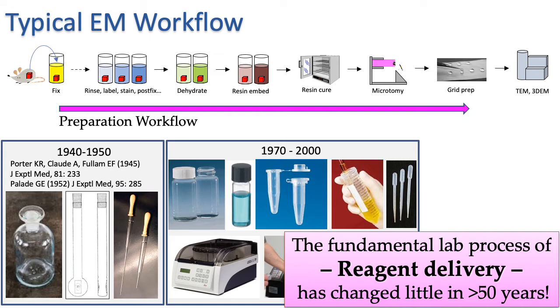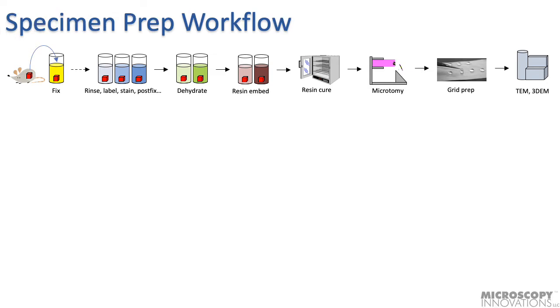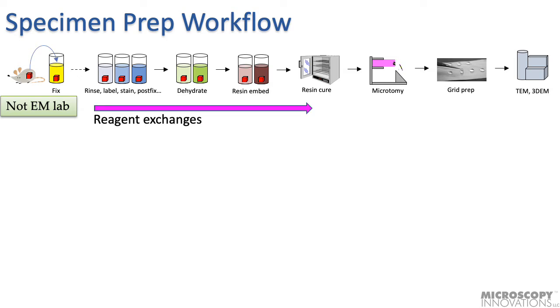Let's take a deeper look into the workflow for different specimen prep applications. The beginning of the chemical prep workflow is the initial aldehyde fixation, which is often not in the EM lab. So this is a different workflow issue. This presentation will concentrate on the reagent exchange part of the specimen prep. Here there is a great opportunity to improve workflows.